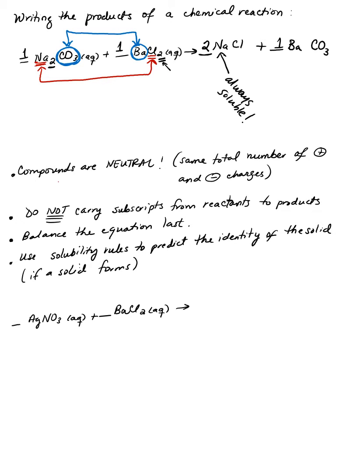So now you can check your barium carbonate. Carbonates are listed as insoluble. You need to make sure that barium is not one of the exceptions. Your solubility rules are in the back of your lab manual. I'm finding the page. You have them in page 190.